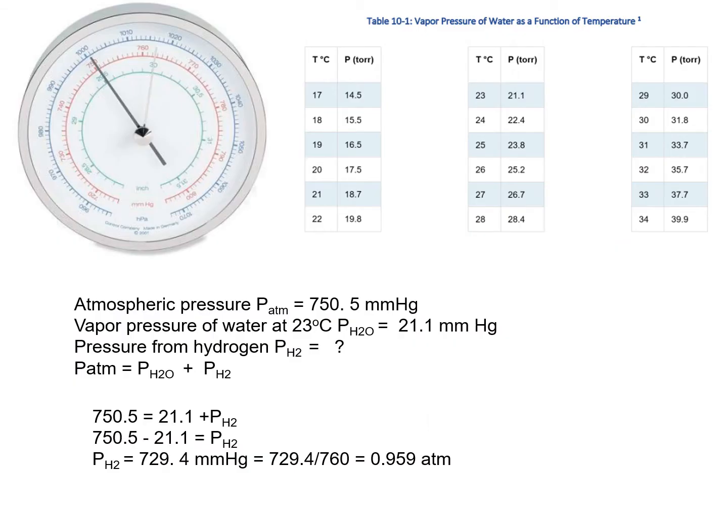All right. This one here is a pressure gauge showing the atmospheric pressure. The atmospheric pressure shown by this gauge is 750.5 millimeter of mercury. You see that this red line here is calibrated in millimeter of mercury, and if you go here and see, that is a little greater than 750.5. So that much is the atmospheric pressure today. All right, so this is atmospheric pressure.